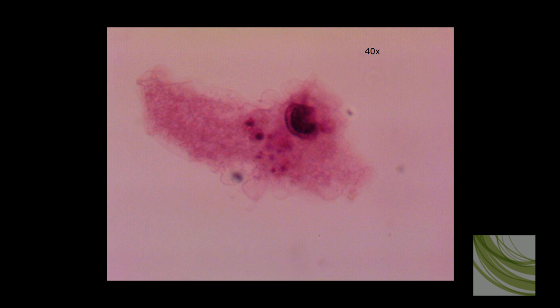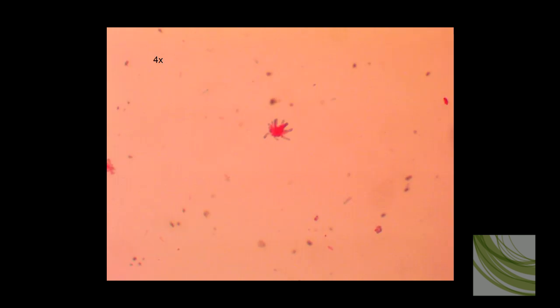Here is our last slide using the 4x objective. This is an amoeba proteus and I like this slide because it uses two different stains. We can see a tremendous number of pseudopods on this animal. We can focus in a little closer using the 10x objective and the pseudopods become very apparent. We can see a nuclei deep into the cytoplasm there.